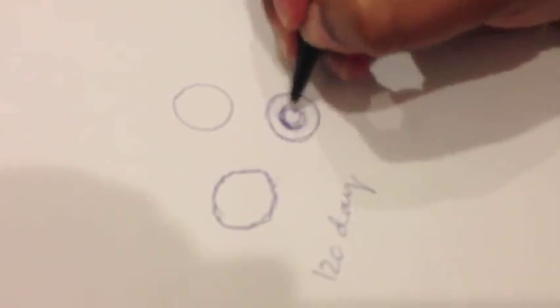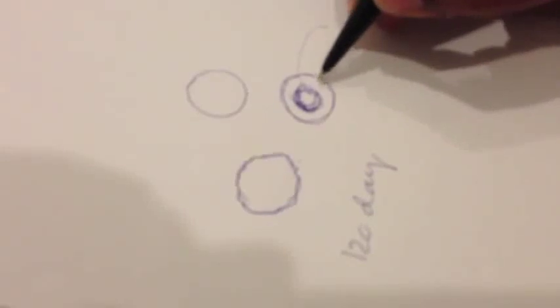Two types of cells. Normally the cells should be really perfectly circular and the membrane is solid, nice and bright. You saw some cells like that and some cells having this ring inside. It's oxidized hemoglobin. When hemoglobin is oxidized, it cannot bind oxygen or iron, so your energy level can drop. But you don't have a lot of those, very few, but compared to the previous time, it's a huge improvement.